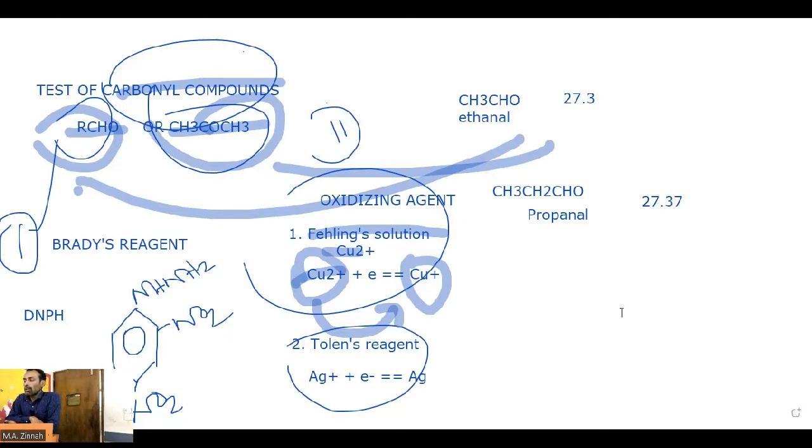Understand? Because when you carry out the experiment, boiling point determination, the result varies plus or minus something. It depends somewhat on pressure, and the result varies, and you have to take several readings and average them.